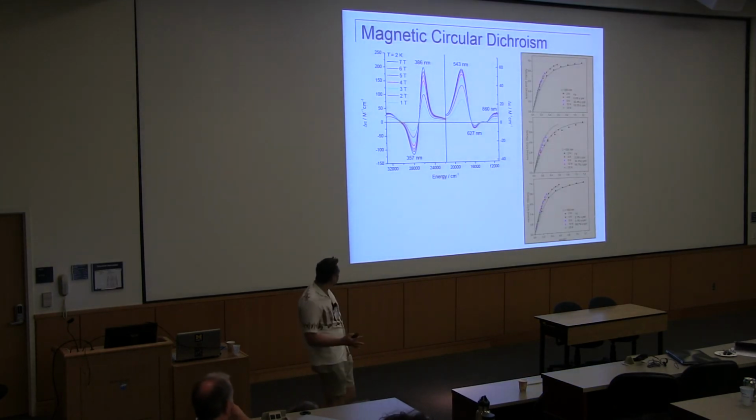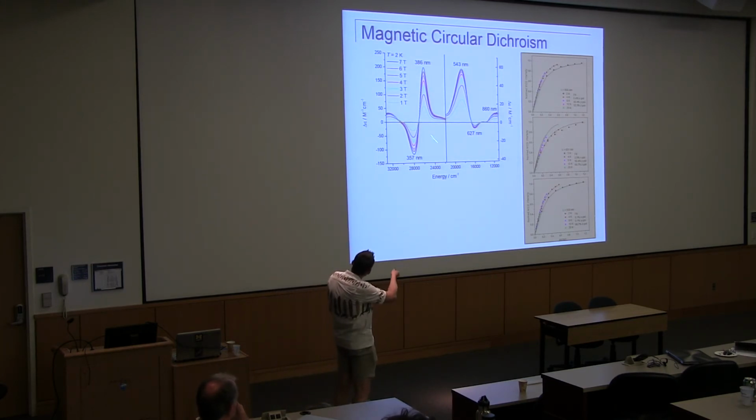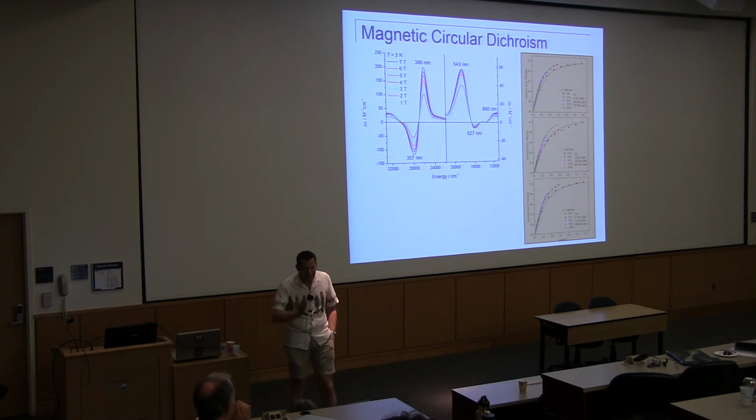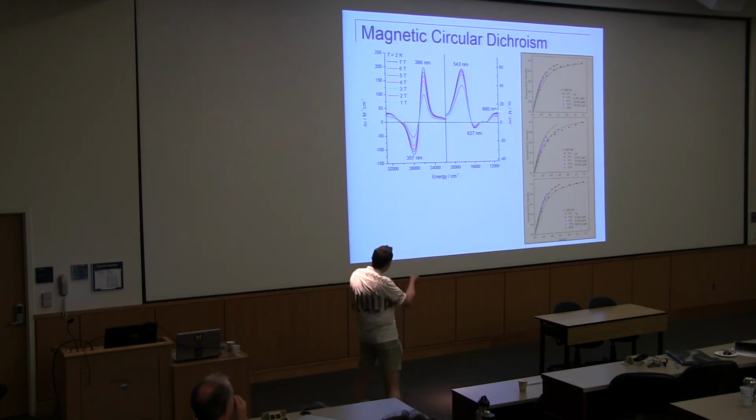And now let's look at the saturation curves, right? Magnetic saturation curves. If we look at the curves that we measure for these weaker transitions in the visible range, you can see they're all strongly Z polarized, especially this big one, which is about 99% Z polarized. The Z direction is along the Fe-NO vector, so this is a charge transfer between the NO minus ligand and the iron center. These weaker transitions are mixed XYZ polarized, so those are probably d-d transitions.